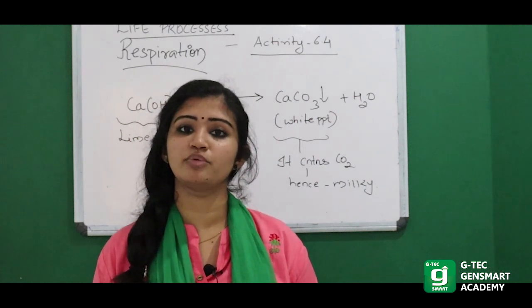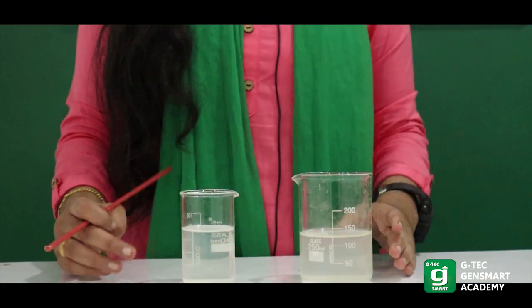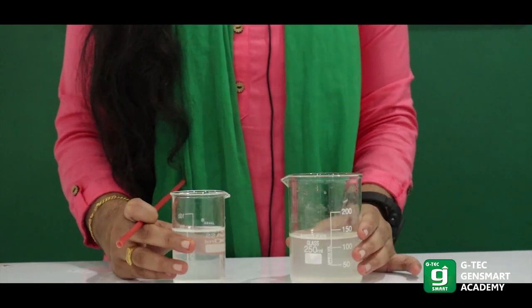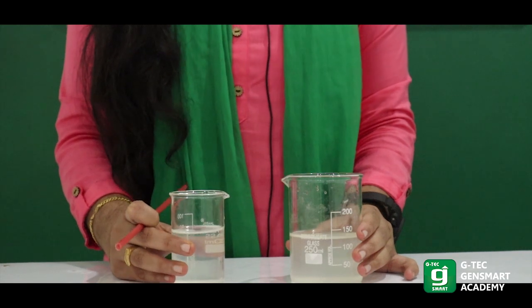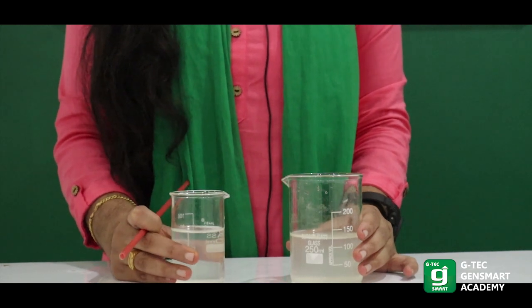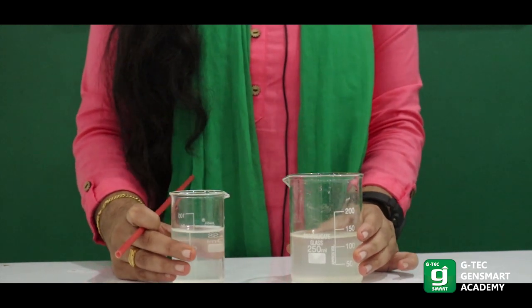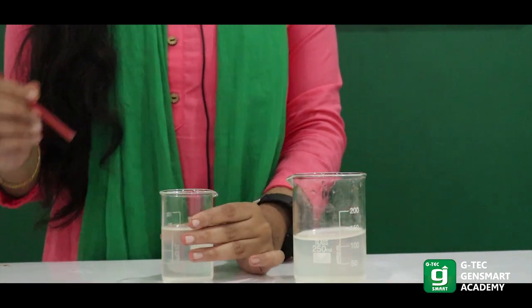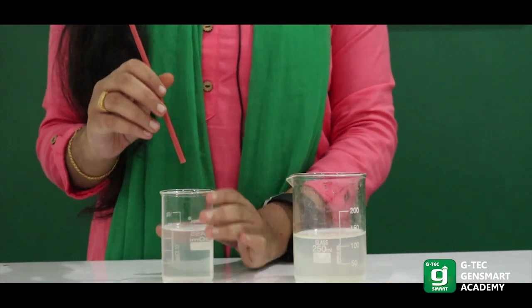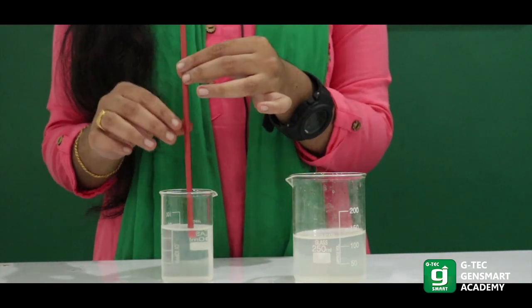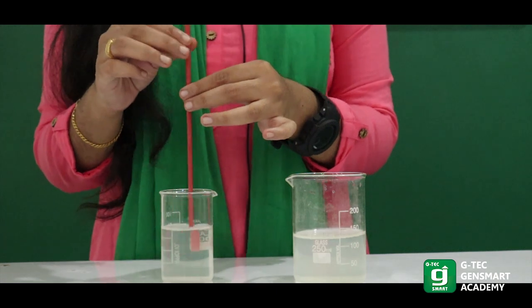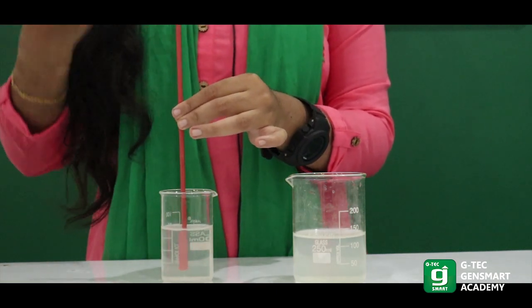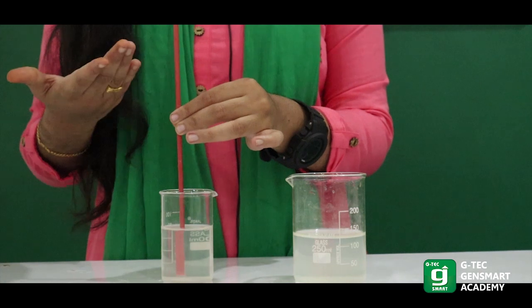Now we are going to prepare the experiment. Here we have calcium hydroxide solution — that is, freshly prepared lime water — in two beakers. In the first beaker, we use a straw. Just blow it. We will be giving out carbon dioxide.